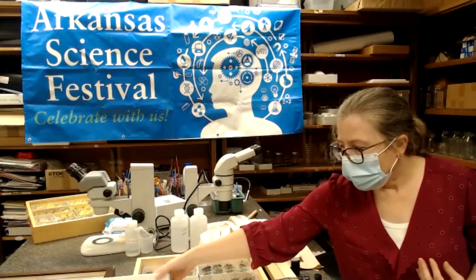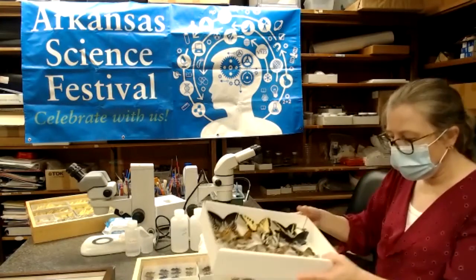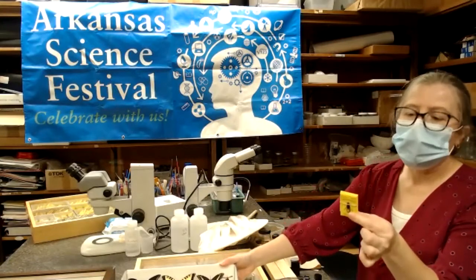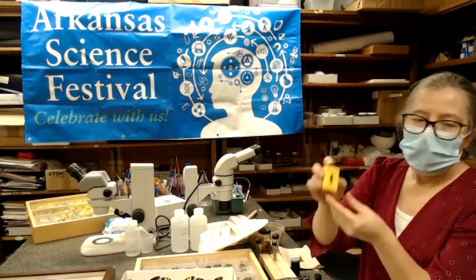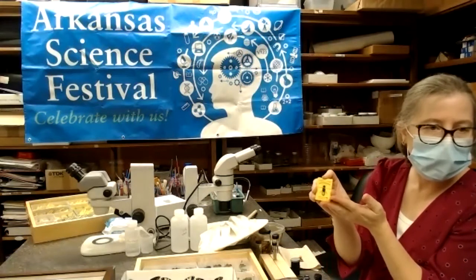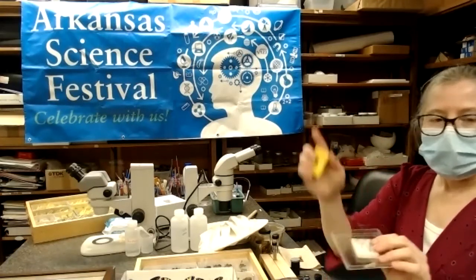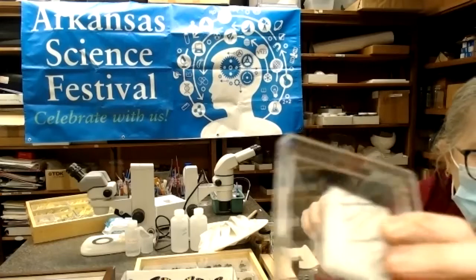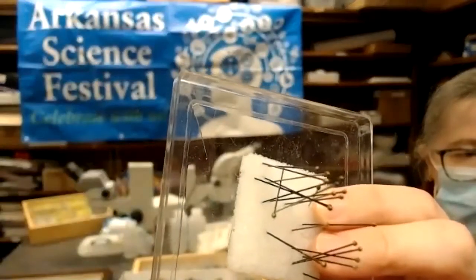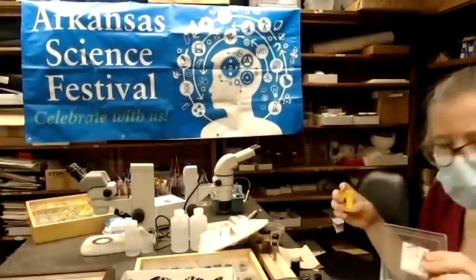Then when you bring them back into your home, you can actually spread them. What you do is you use insect pins that are used for pinning insects, and they are only used for pinning insects. You could buy these from insect companies that have insect collecting equipment online. That's the best way to get those types of equipment. But these pins are so designed, if you look at here they are, let's see if it picks it up. There you go. You can see that they're coated with a coating that makes them so that they don't rust.